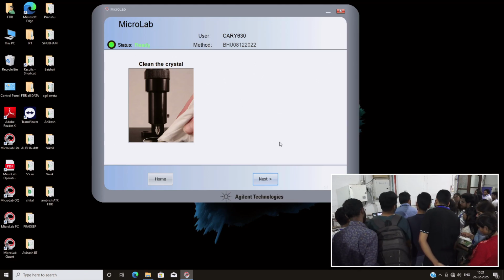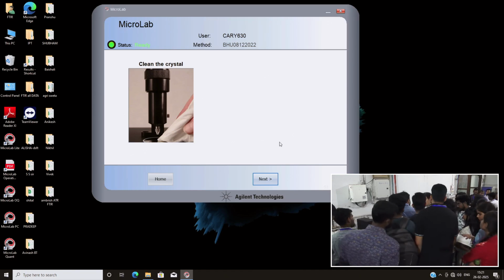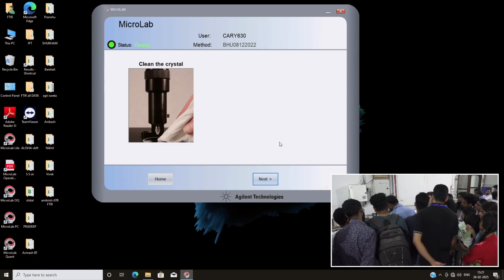It's fructose now. Okay, fructose. We are doing fructose. So the sample is fructose, 5 molar.